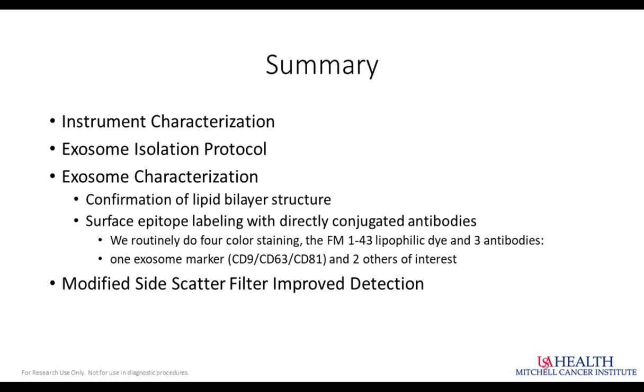So I've shown you that there are a variety of methods to isolate exosomes. I strongly encourage you to try several of them. It depends on what kind of starting material you're using. Plasma is much more dirty than, say, urine if you're going to go after a biofluid. Culture supernatant is pretty easy, and ultracentrifugation is pretty standard for that. But try lots of things. See what in your hands gives you the best result.